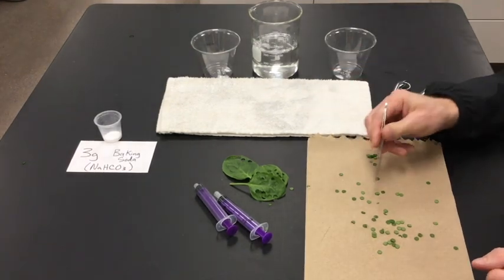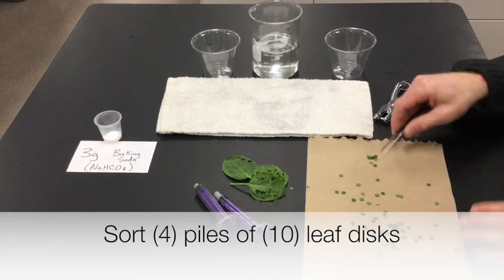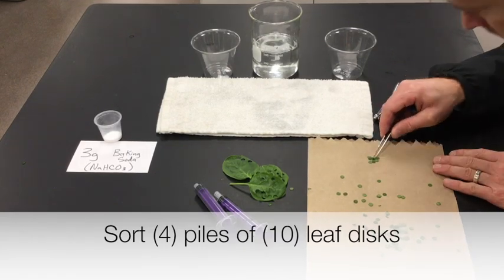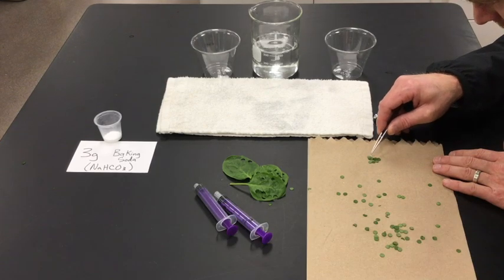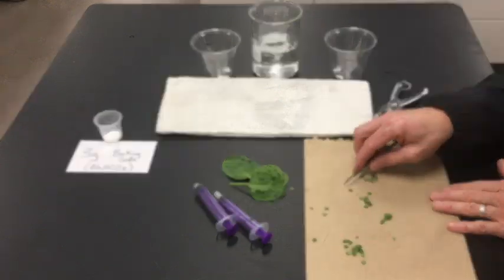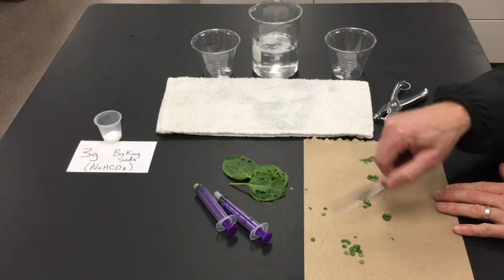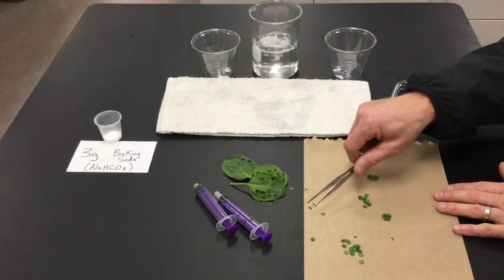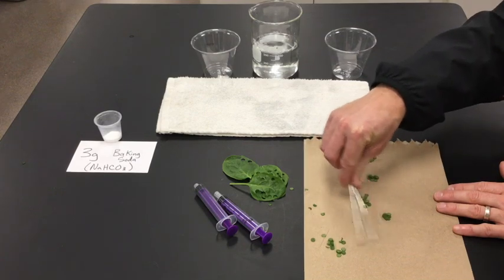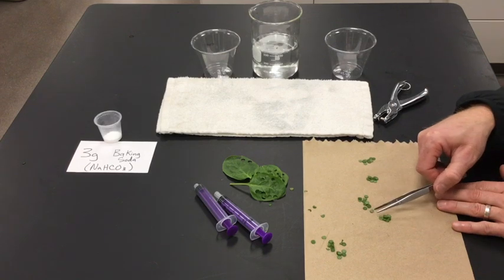I punched a bunch of holes out of the leaves to make little leaf discs, and I'm going to sort these into groups of ten. I have four groups of ten, and I set aside some of the ones that weren't very well punched as extras in case I need them later. One person in the group should try to get four piles of about ten or so.